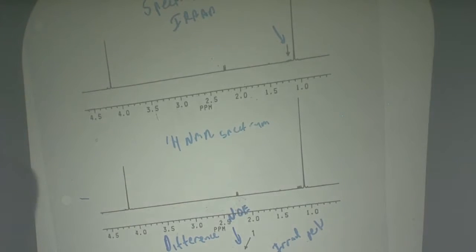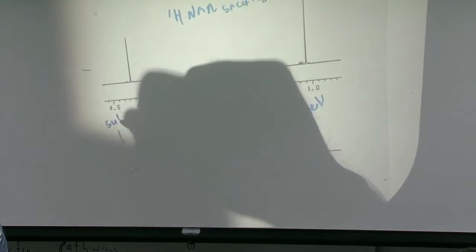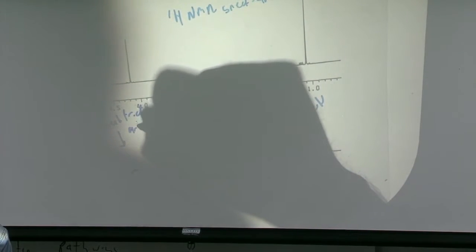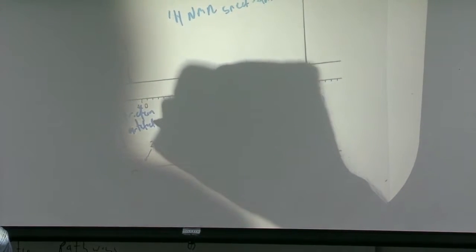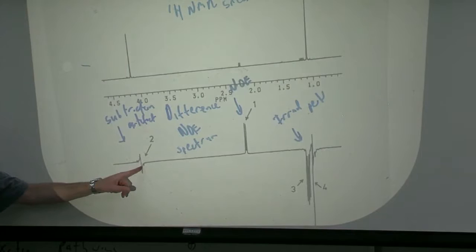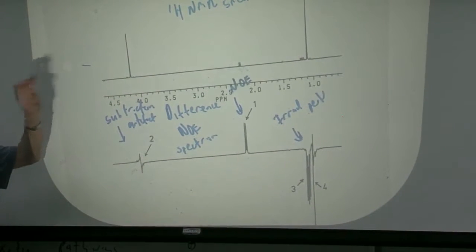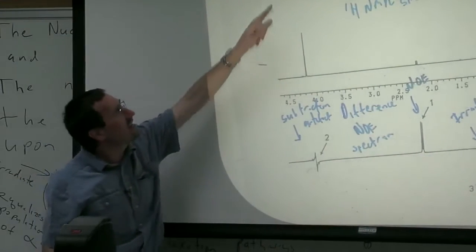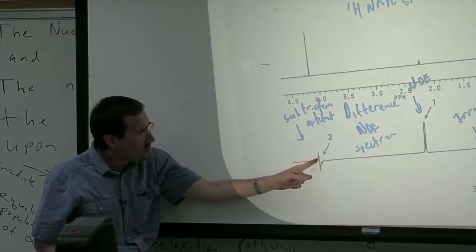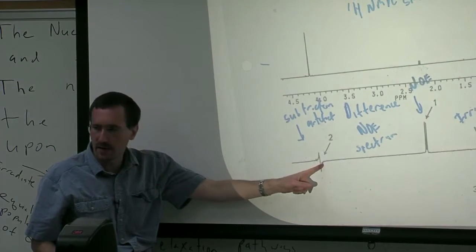So this is what you would call a subtraction artifact. In other words, it's not an NOE. We don't have a particular peak up or down. What's happened is there's been an infinitesimally, a teeny tiny shift in the position of this peak because of the irradiation, which gives a positive character on one side and a negative character on the other side.